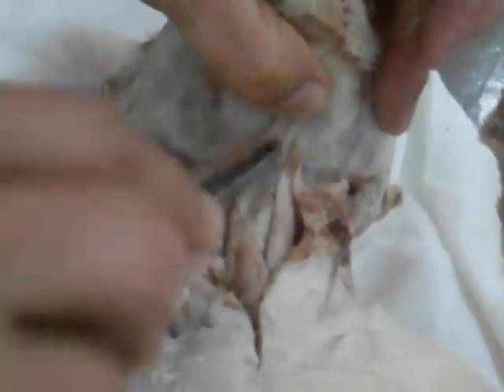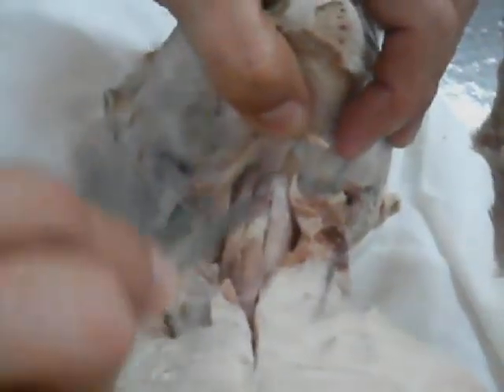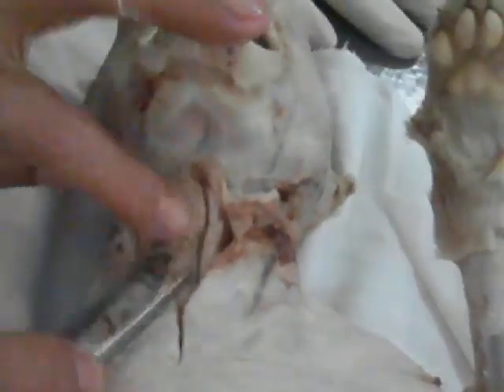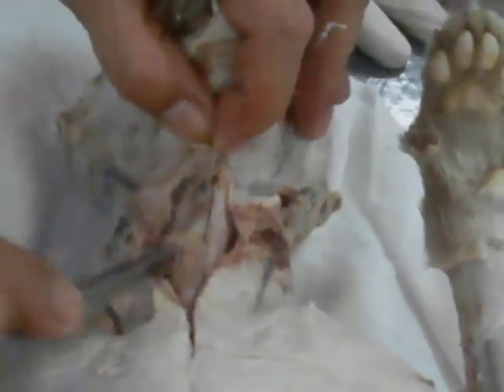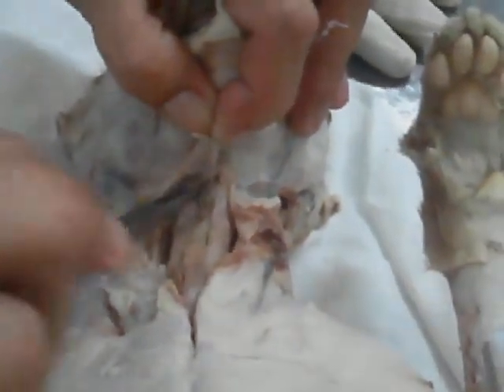Sternothyroid, hyoid, sternohyoid. Thyrohyoid — one and two. They are two different muscles, named after their origin and insertion: sternohyoid and thyrohyoid.